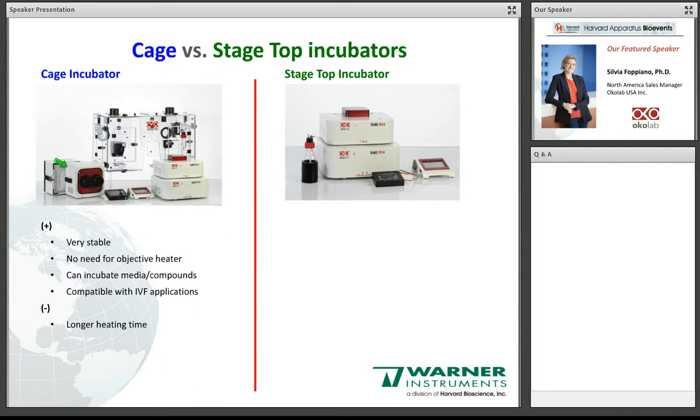However, because of the volume of this enclosure, it takes longer time to heat it. On average, it takes maybe 30 minutes to warm the air up inside, but an additional 2 hours are recommended to have all the microscope components at equilibrium. You can never do temperature cycles, and this is also due to the size of this enclosure.